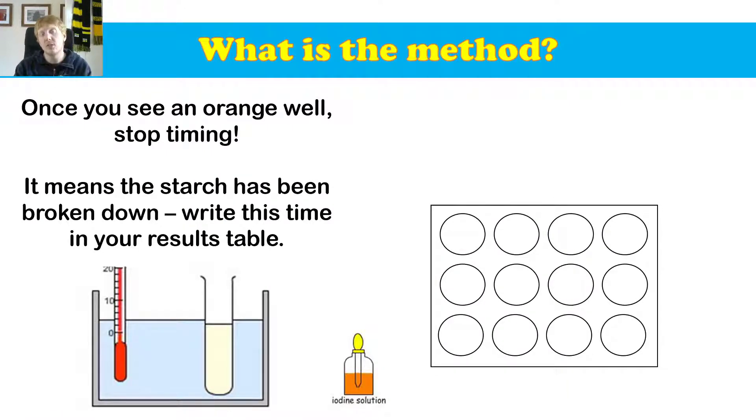Let me show this to you a little bit more visually. So once we see an orange well, we're going to stop timing. It means the starch has been broken down, and we're going to write these results in our table. So let's have a look how this works. At zero seconds, we're going to put some iodine on our tile. And we're just going to put iodine across all of the tiles. So we're going to drip it, drop it, and we're just going to put it along the hole. So every tile has iodine on it.